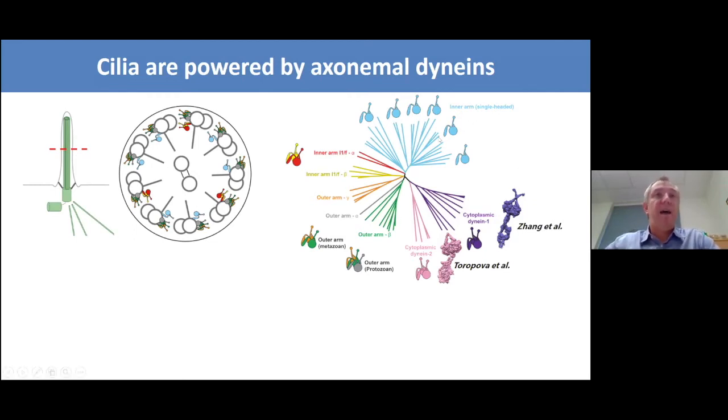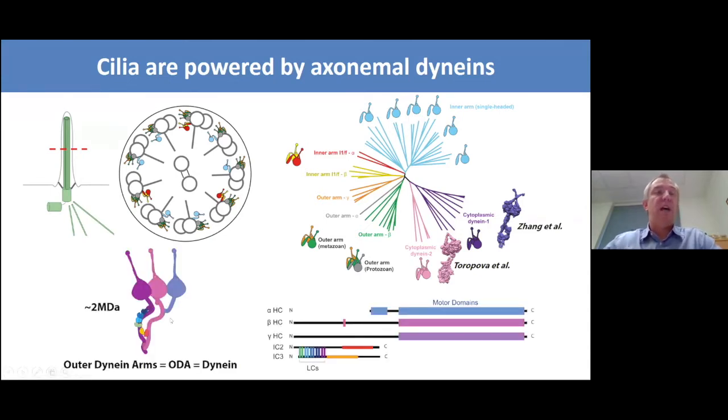So far for the dynein family, we have structural information from cryo-EM of the cytoplasmic dynein 1 and 2. These are involved with transporting cargoes. But so far, no structures of the axonemal dyneins, although I'll tell you about one today. So today's talk will focus on the outer dynein arms, also called ODAs. We're going to talk about this 3 heavy chain, 3-headed motor. And you can see it's a complex both of these heavy chains, but also of intermediate chains and a whole set of different light chains.